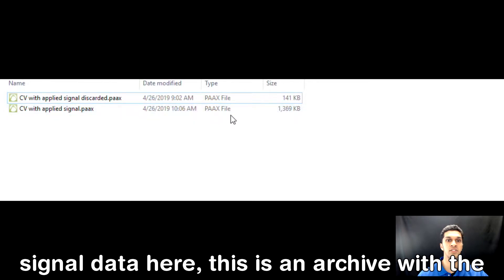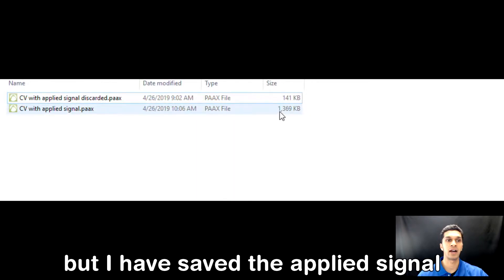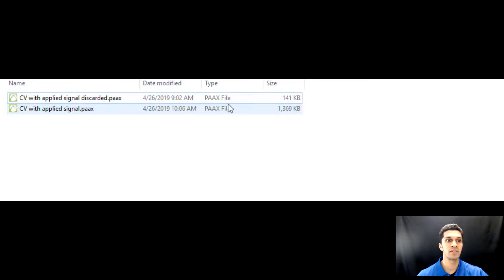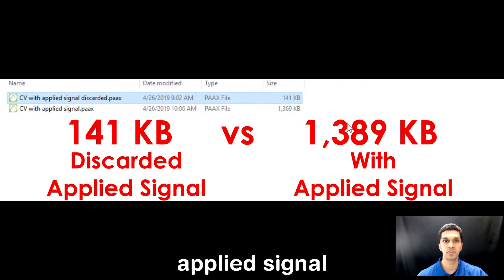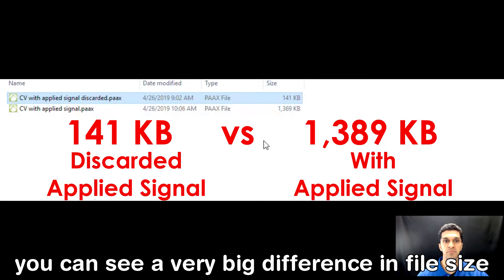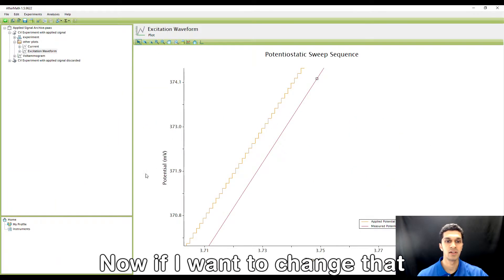For example, for the same experiment I'm going to go to this signal data here. This is an archive with the same cyclic voltammetry experiment but where I have saved the applied signal, and this one is where I discarded the applied signal. You can see a very big difference in file size.